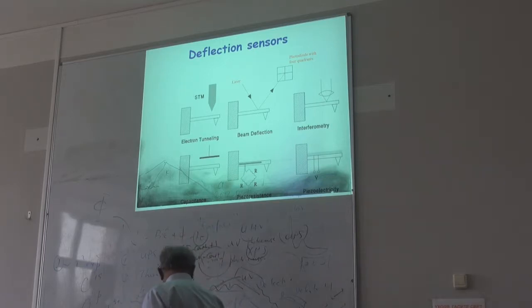The important thing is, once you do the AFM, you can measure the thickness. Suppose this is your substrate, and suppose this is your sample. When you go from here to here, you see some height increase. From that you can measure how many layers there are.